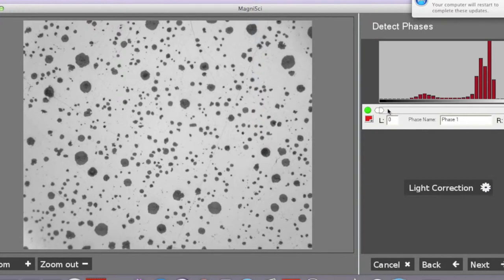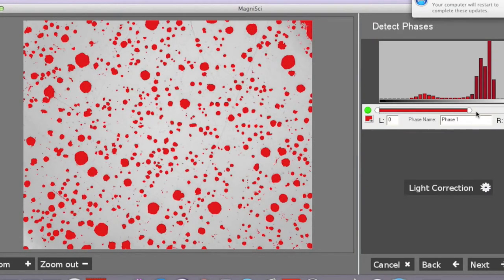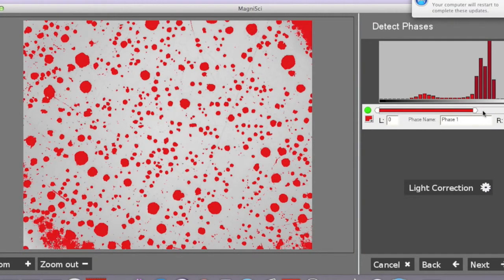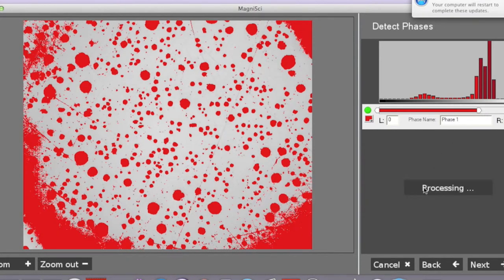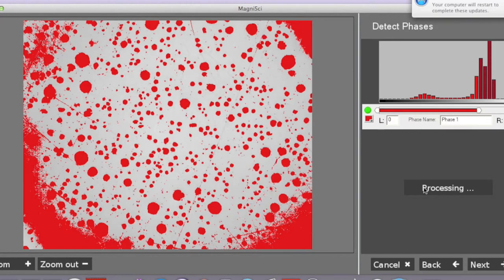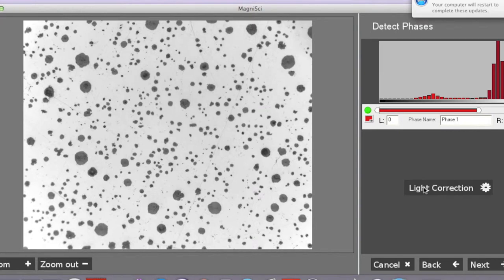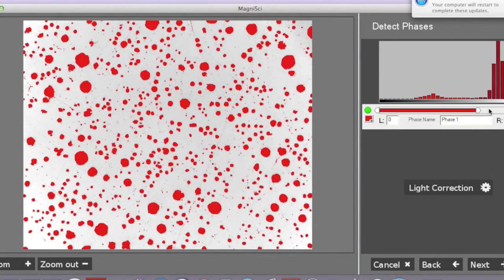Our second step will be to select the region of the particles by brightness. The illumination is giving us a problem. We will correct it using the light correction option. We can now choose our particles more accurately.